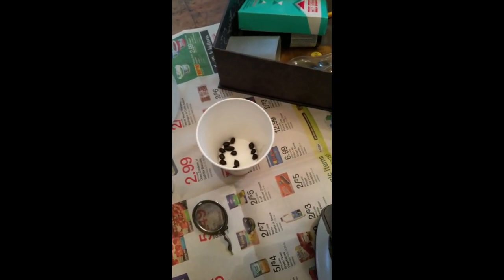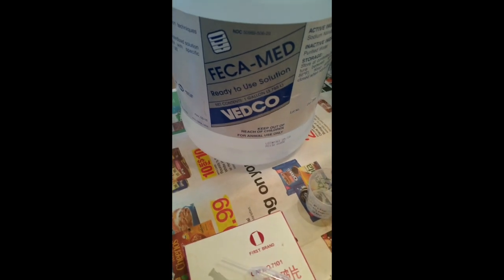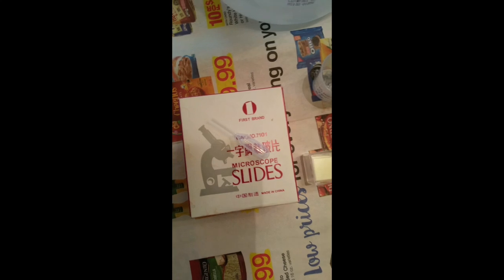Truly Scrumptious has been coughing in the morning - she's the only one - so I thought let's get a little fecal sample. First you're going to need goat poop, then fecal solution, a little pipette, and a microscope.